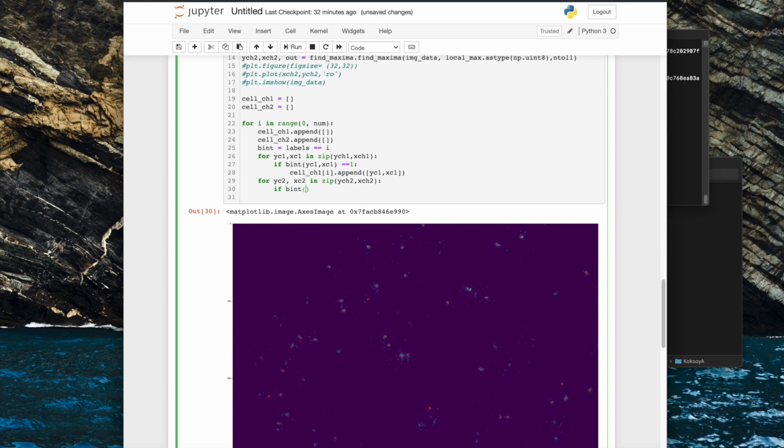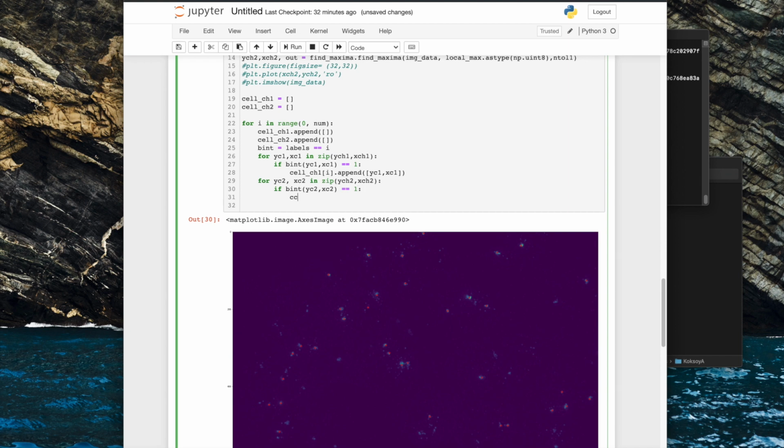And then we'll check if these exist as well within a cell. And then if they do, then we'll add it to our second list.